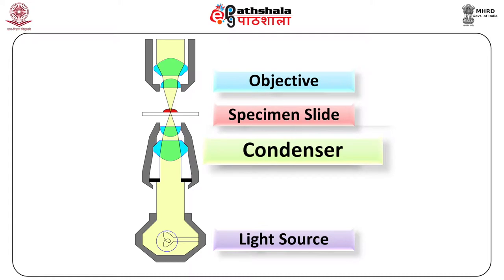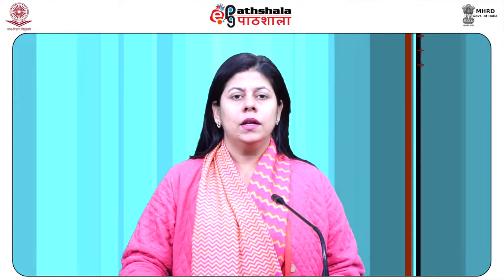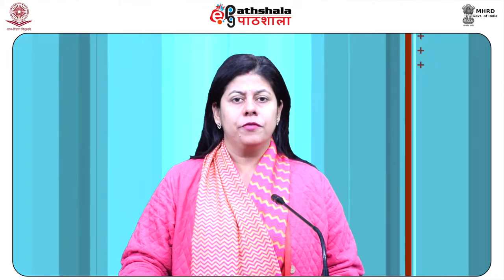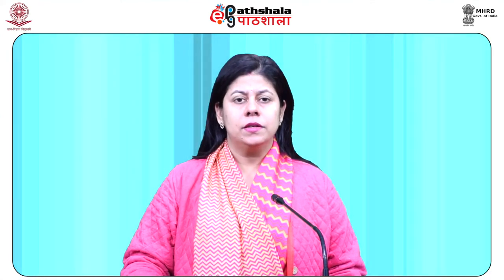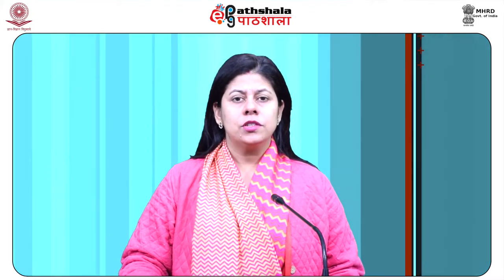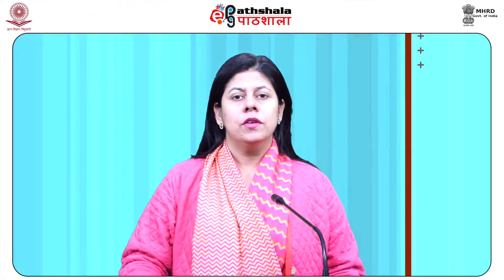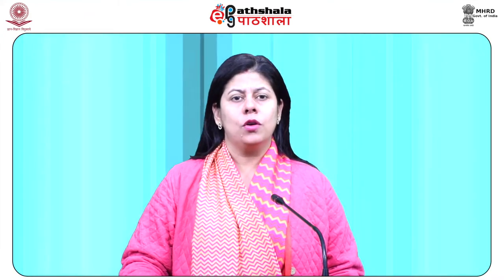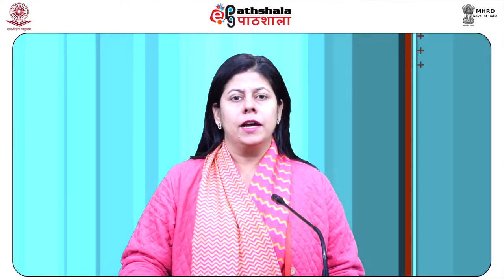Condenser. The condenser is a lens designed to focus light from the illumination source onto the sample. The condenser may also include other features such as a diaphragm and filters to manage the quality and intensity of the illumination. For illumination methods such as dark field, phase contrast and differential interference contrast microscopy, additional optical components should be precisely aligned in the light path.